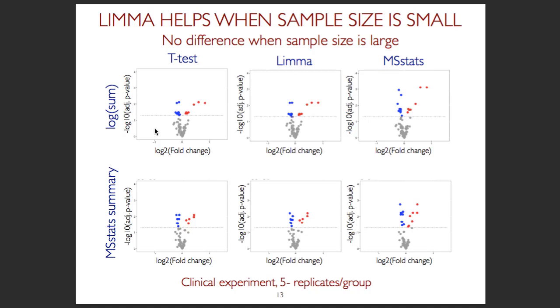And it's always the case in statistics that when you bring in more information, you do better. For example, LIMMA said, well, I don't have one protein, I have many proteins. We can leverage that. Now, MSstats says, well, these are not missing values, they're censored values. We can actually work with that. And then we have multiple protein features which are expected to behave the same way. If they don't, maybe there's something wrong. We work with that as well. So this is why. Now, if the data are really nice and clean, probably a t-test would work very well. Usually these methods help, especially when you have interferences or problems that deviate from the expected behavior.